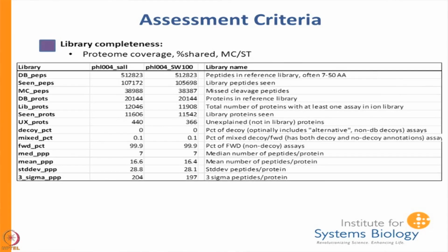One caveat: this is the number of perfectly tryptic peptides that match the perfectly tryptic peptides here. So 20% of the entire proteome is covered in this library. We know that there are about 12,000 out of 20,000, so we've only covered 60% of the proteins. For those proteins, we're just not getting perfect coverage.